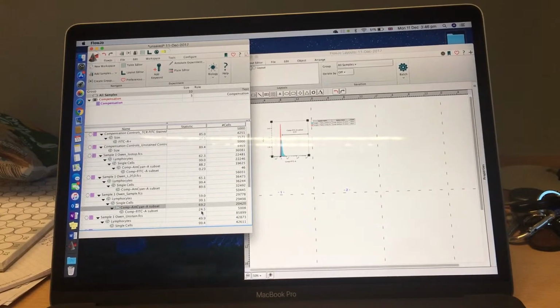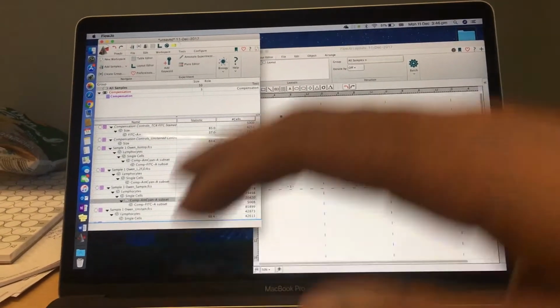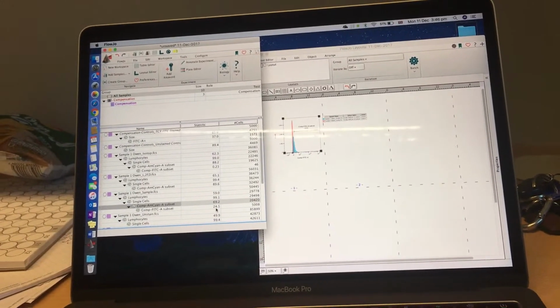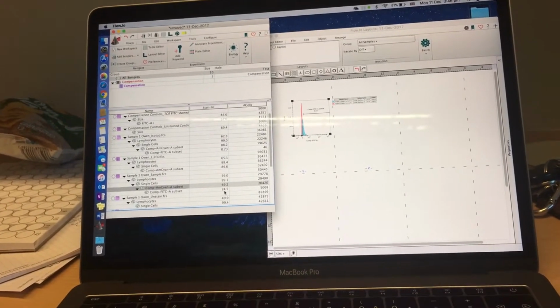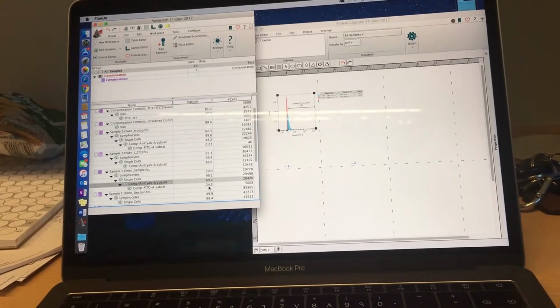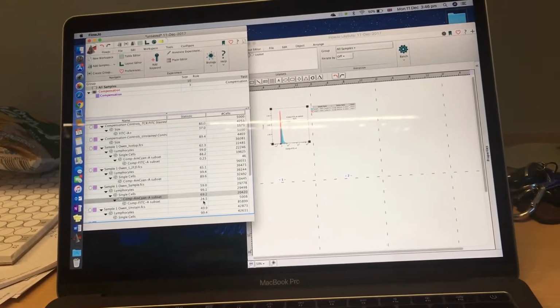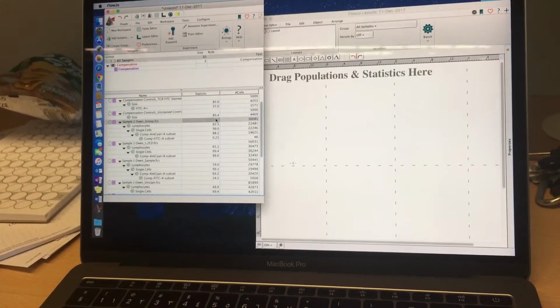Good. So what I do now, in the layout I make it like this, to show how I get the result for whatever I'm going to show. So here you take each gate as you made it. So delete that.